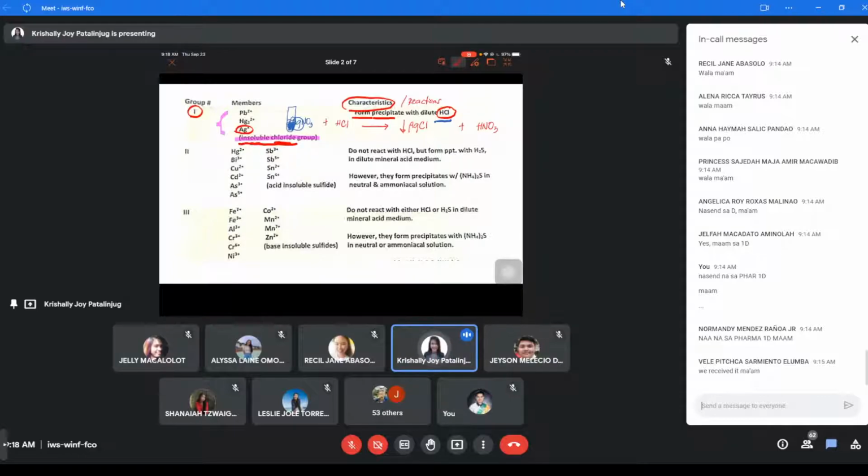This is the precipitate. By the way, in chemistry, when you write a chemical equation and a precipitate forms, you put an arrow down, meaning there is a solid precipitate. This nitric acid remains in solution in the test tube. So that is the purpose of hydrochloric acid in this reaction.